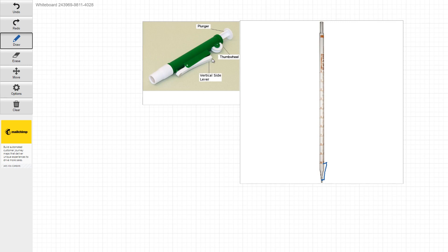So when you guys turn this thumb wheel, this plunger is going to start coming up. And if the tip here is in liquid, it will draw the liquid up. So very important when we're using these guys, don't turn them upside down. We don't want to get any liquid into this area here because you can ruin the pipetters that way.